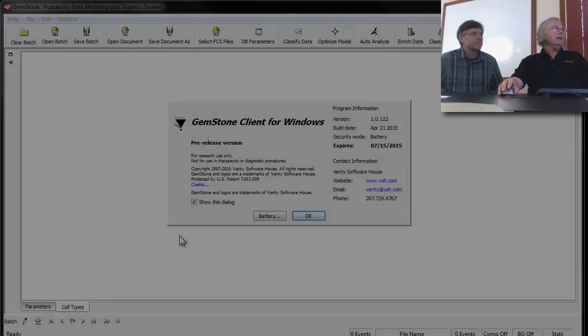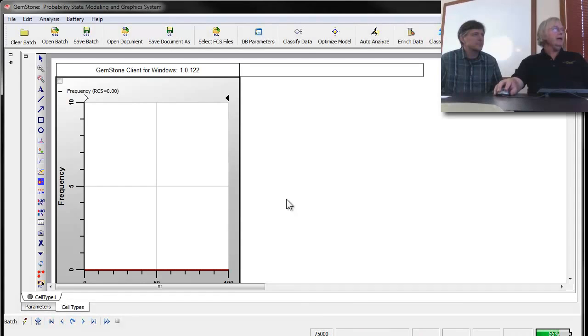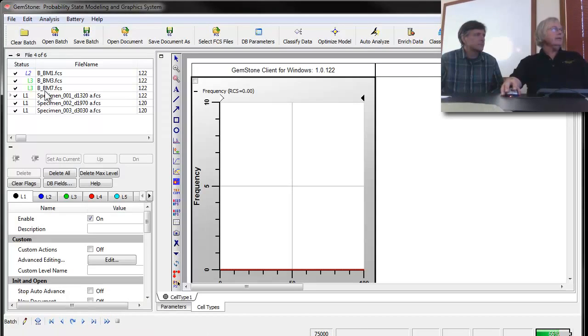Yeah, it ends up that with T cells, it's actually easier to select for the cells of interest because they're very well defined peaks. So you'll find that this is actually easier than the B cell situation. I like easy. Okay, easy is what we got. We'll click on gemstone, click OK, and like with the B cells, we're going to load in a file that's looking at peripheral blood T cells.